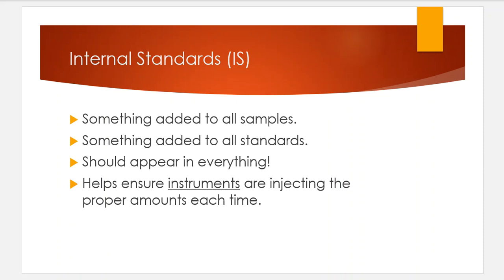Okay, in the last video, we talked about internal standards, abbreviated with IS, and we compared that against a surrogate, which is abbreviated as an SA. Both of these are unlikely to be found in samples, and both are added in known concentrations, but the surrogate is added only to my samples, and the internal standard is added to everything that gets processed. The surrogates are typically added at the beginning of the process, and internal standards are typically added at the end of the process.